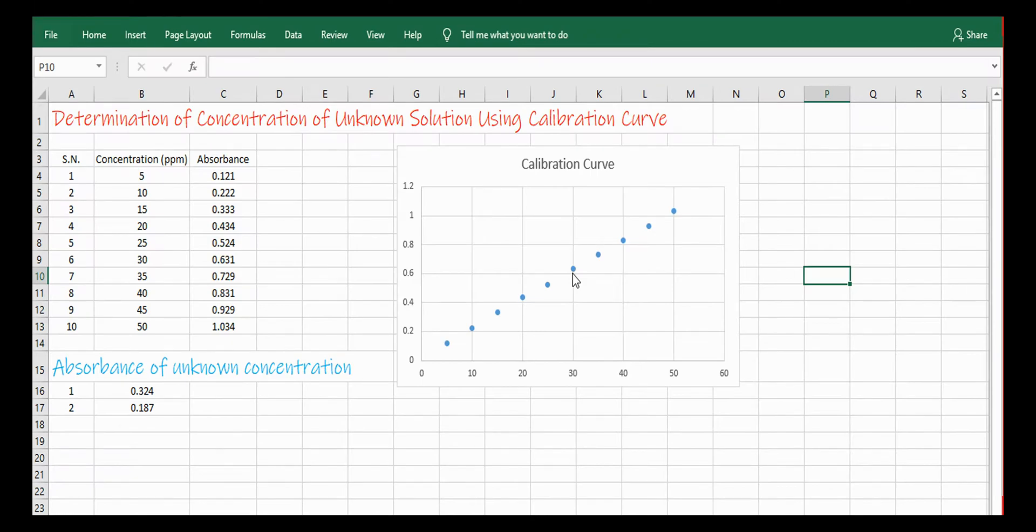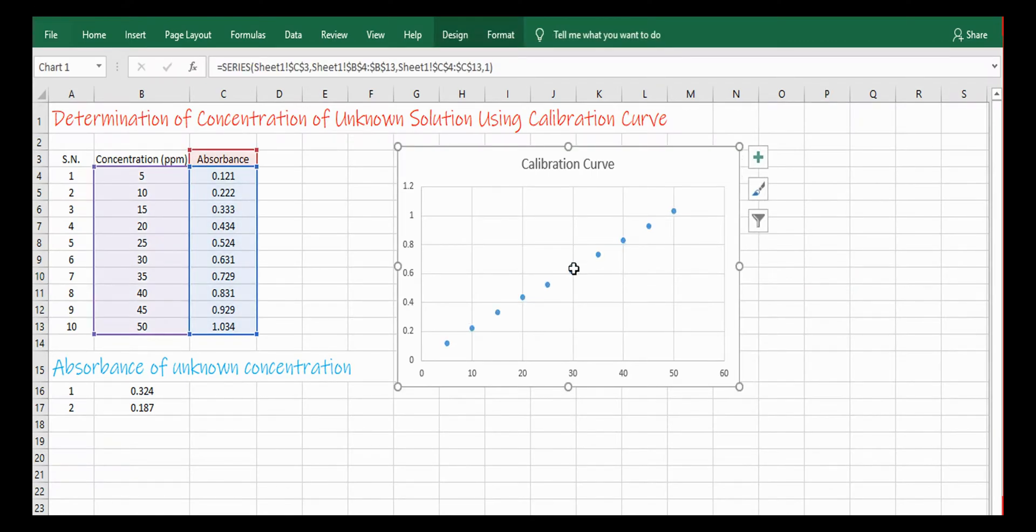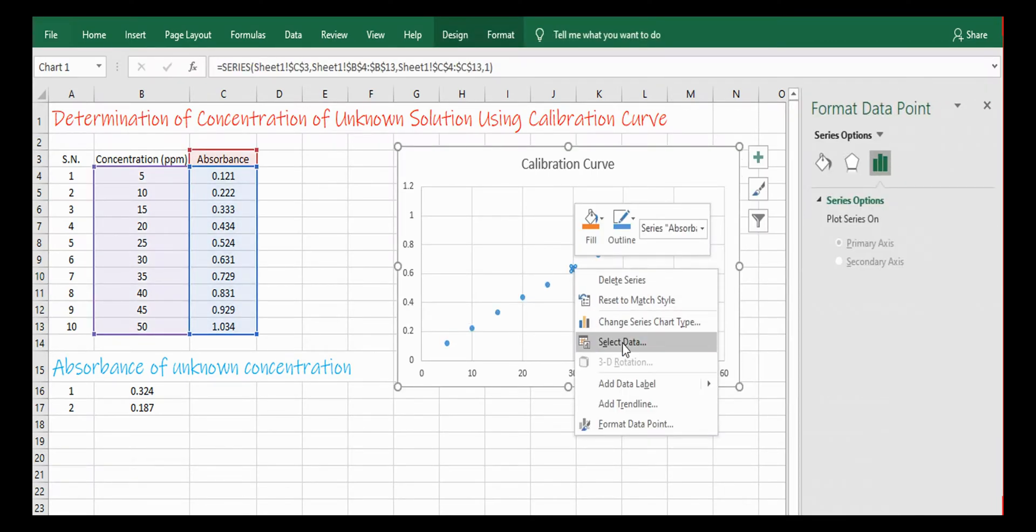Now you can click any point of the line. Then you will see like this and then right click. After right click you will see like this. And select Add Trendline.